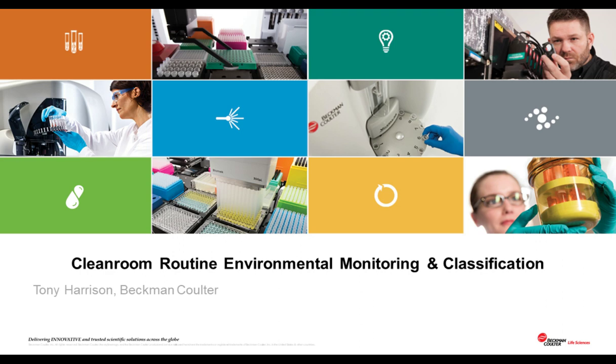Hello and welcome everyone to this short webinar today on cleanroom monitoring and classification, specifically for the GMP environment. My name is Tony Harrison, and I'm a Senior Manager for Beckman Coulter. I was also the UK expert to the ISO working group responsible for writing the 2015 edition of the ISO standard for cleanrooms, ISO 14644-1.